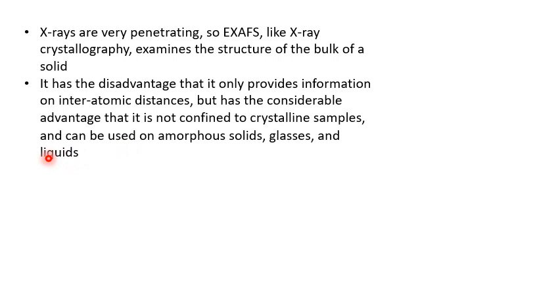This was a drawback of X-ray diffraction analysis, which can only be performed for crystalline substances, whereas the EXAFS technique can be performed for crystalline as well as amorphous substances.